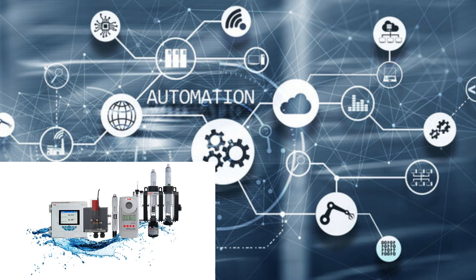That's a great question. Like any technology, these sensors have their limits. One of the big ones is the measuring range. The Turbimax CUS52D, for example, can accurately measure turbidity up to 4,000 FNU. FNU. What's that stand for again? It sounds like something out of Star Wars. It stands for Formazan Nephelometric Units. Think of it like using teaspoons to measure flour. It's just a standard unit that everyone uses, in this case, for turbidity. Gotcha, that makes sense.